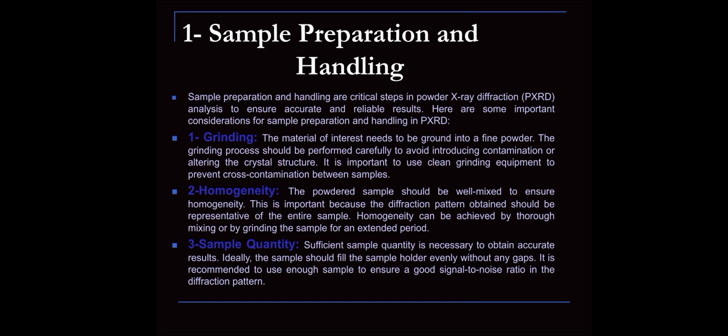Second, homogeneity. The powder sample should be well mixed to ensure homogeneity. This is important because the diffraction pattern obtained should be representative of the entire sample. Homogeneity can be achieved by thorough mixing or by grinding the sample for an extended period.